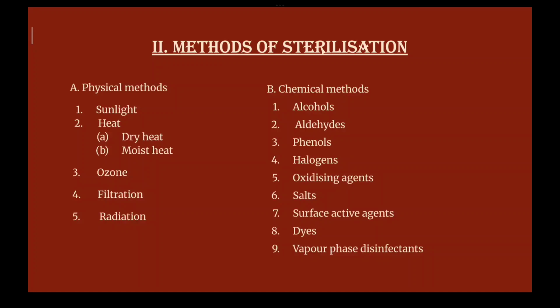Now heat is another method that can be used in the laboratories, like the Bunsen burner that we have been seeing from our 6th to 7th standards. These Bunsen burners can be used for dry heating. Sometimes there are certain machines that are built for sterilizing microbial media, culture media, or the surgical equipment that is used, and various other media that have implants, or any other media that has to be sterilized, will go through this heat sterilization physical method.